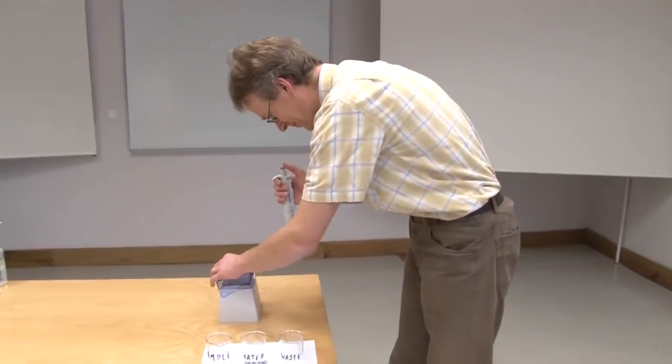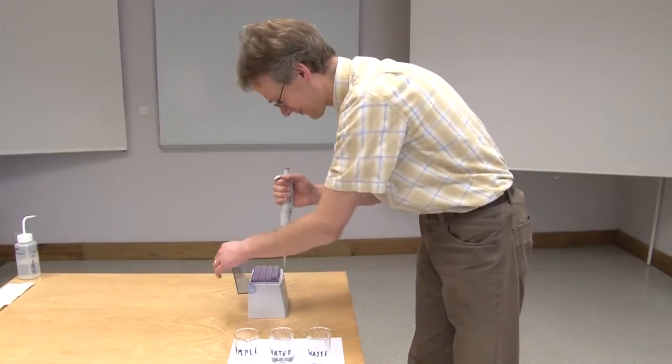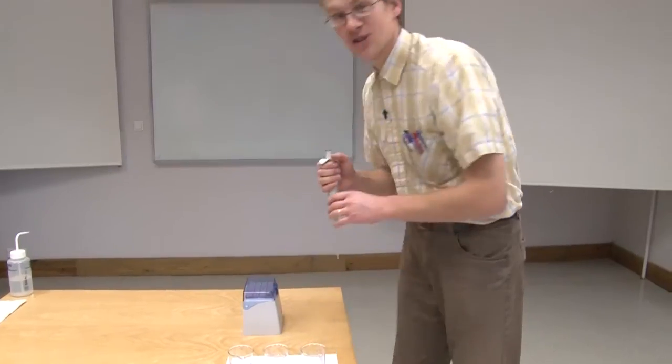Before pipetting I need to attach a pipette tip to the pipette. Now the pipette is ready for use.